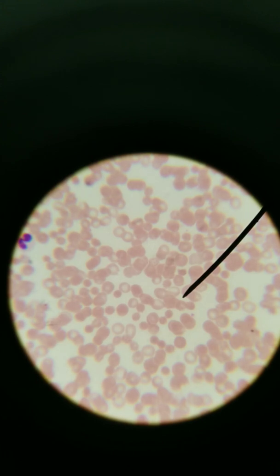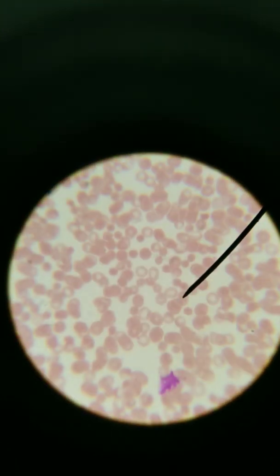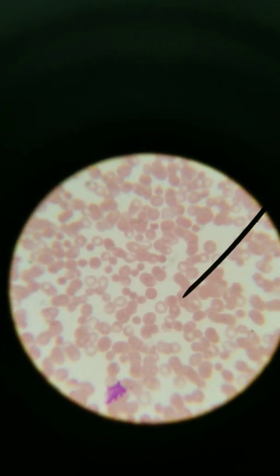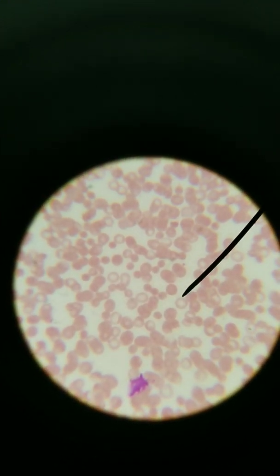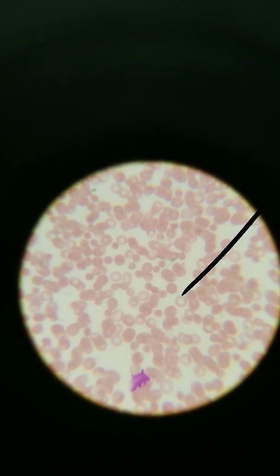Okay, here we're looking at a regular blood smear. These are normal erythrocytes. We know they're normal because we can see the nice roundish shape. It's best to look at ones that are on their own. You look at the outer edges of the erythrocyte. It's darker red. The middle is lighter because of the biconcave shape of these cells. We are at 1000x, the oil immersion lens, 1000x total magnification. That's what a normal erythrocyte looks like.